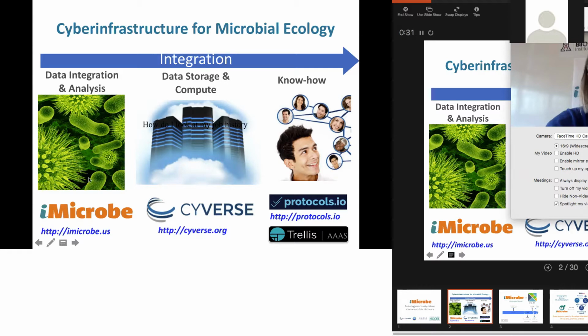With iMicrobe, one of the things that we're interested in doing is building a cyberinfrastructure for microbial ecology. As part of that, the iMicrobe project is really integrating different data types and analyses and making it possible for the community to use tools that are important for microbial ecology. All of that work is built upon CyVerse, where we have all of our data storage and compute.